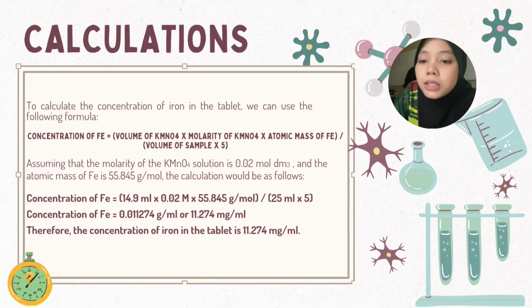If the entire tablet was not dissolved, the result may be inaccurate. It is important to ensure that the tablet is fully dissolved before conducting the titration.